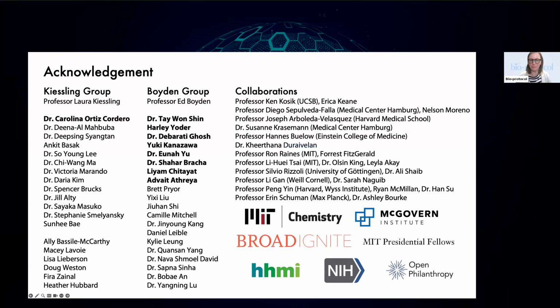Pooja asks, does this technique focus only on one protein at a time, or can you look at multiple proteins, for example interacting proteins as well? You can definitely look at multiple proteins. For the synapse example, we used 2 proteins. Actually, that experiment is 3, because it's in Thy1 YFP mouse brain tissue where we're also seeing YFP. So it really is compatible with normal fluorescence imaging. Depending on how many channels your microscope has, you will be able to use multiple proteins.